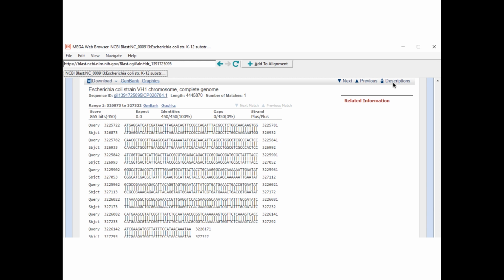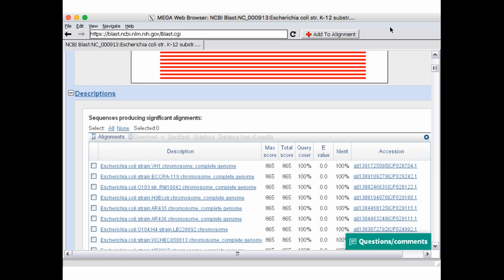So that's what we've added. If you go back and click this word descriptions, now it will take you back up to where you left off in the list, which is not so important at this point, but further down in the list, that gets to be a really convenient thing. So here's the list again. We've added that, and now we have to look at every one of these other ones and decide whether to add it.